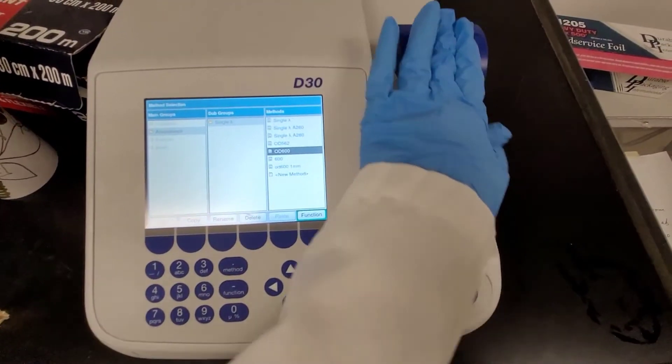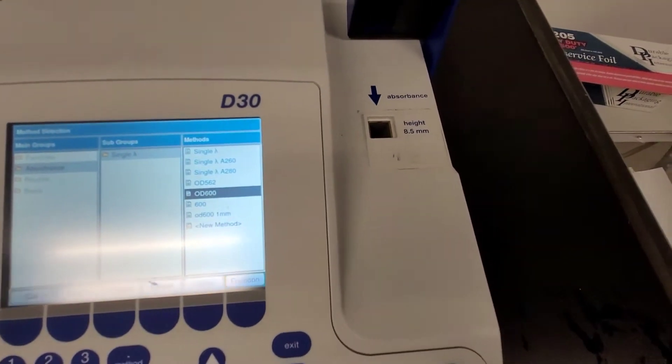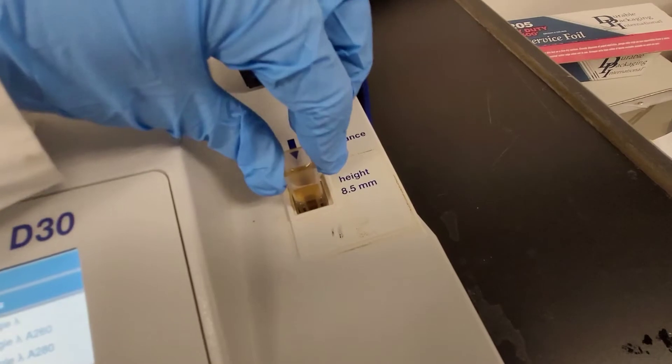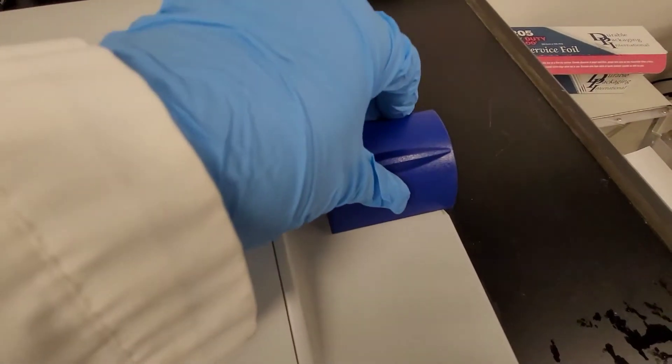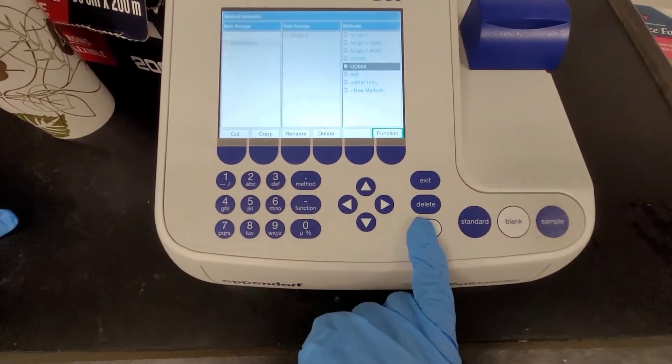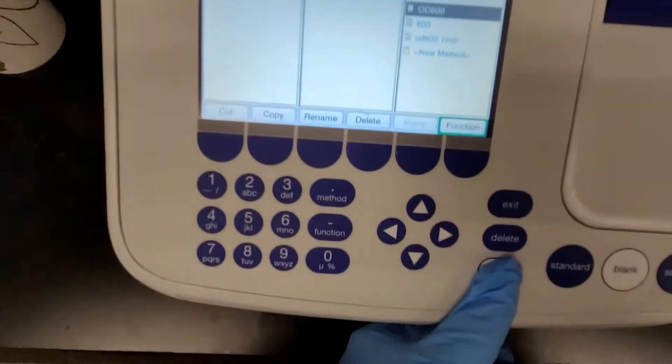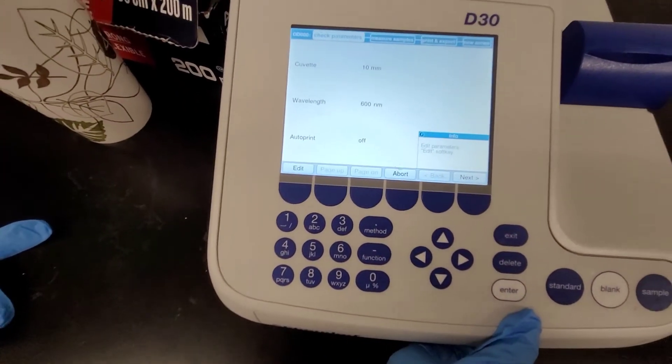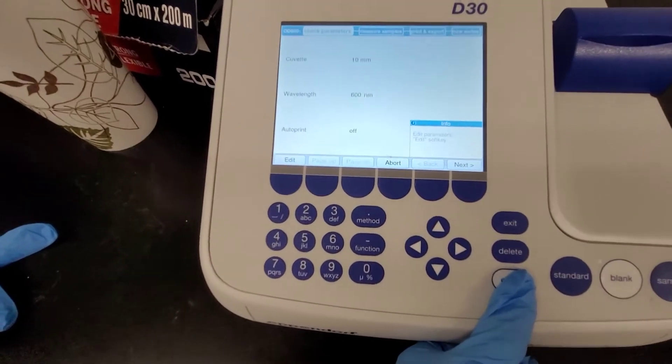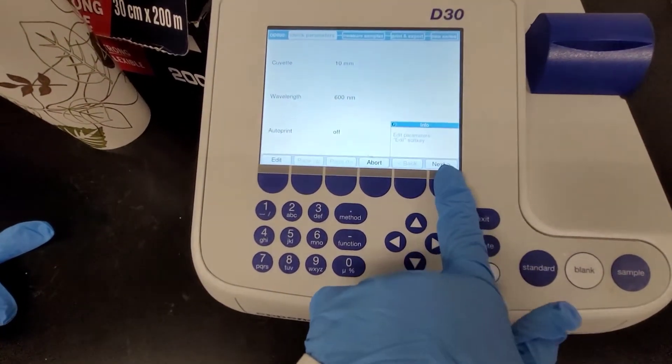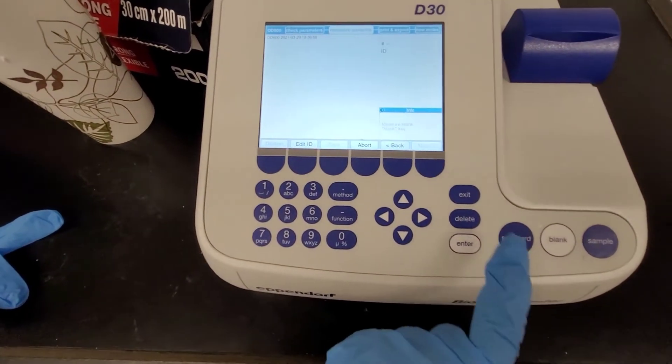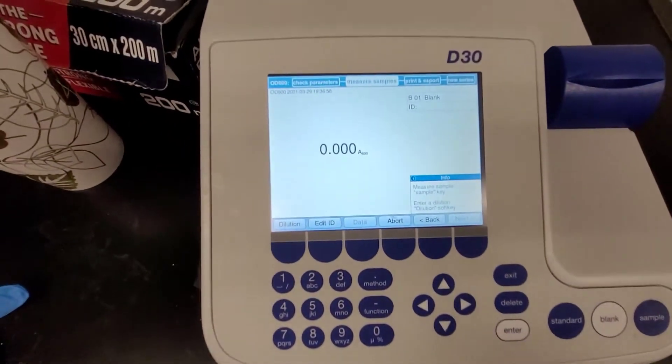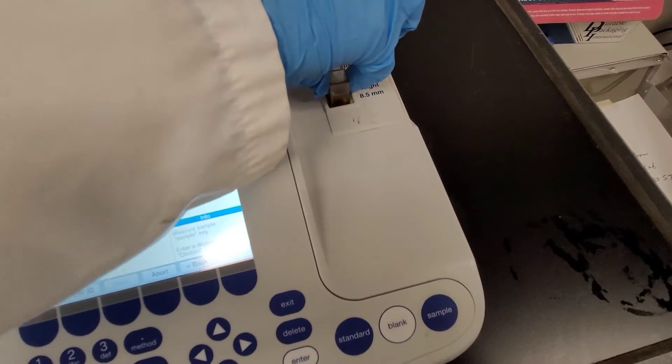Now I'm using a spectrophotometer to measure the blank. Depending on your instrument it might be a little bit different, but it's usually very self explanatory. You want to select the OD, optical density, at 600 nanometer. First you have to blank it with your blank solution so that will be your zero. As you can see, I select the blank and now it's zero.